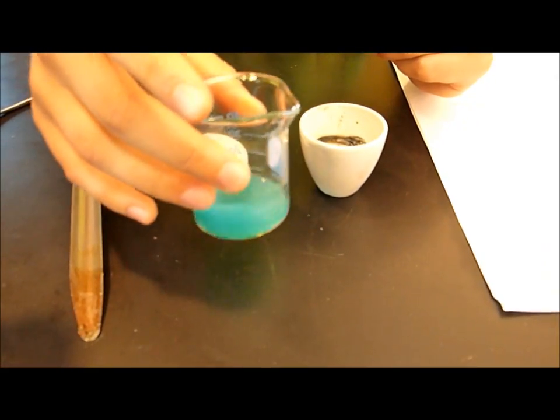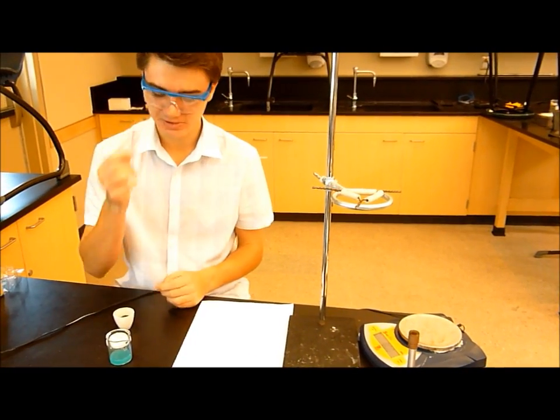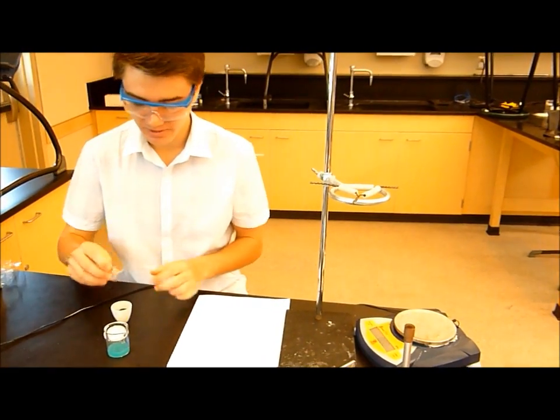Now you need to measure out about 20 centimeters of aluminum wire, and coil it so that it will fit in the beaker.